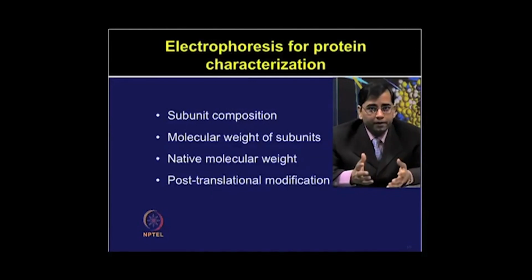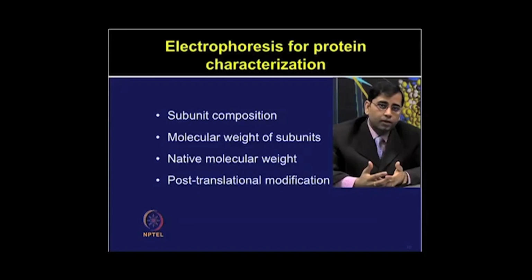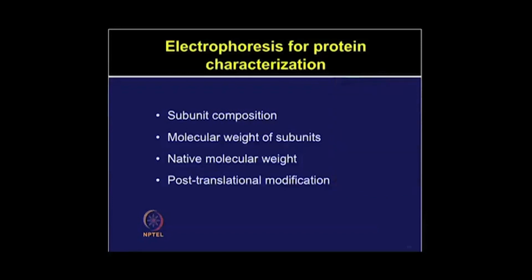If you want to compare the proteins based on their isoelectric point, as well as the separation of isoform or PTM form based on the molecular weight, again two-dimensional electrophoresis will be useful. So one needs to know the concept and the laboratory way of using these techniques, so that by applying a combination of the techniques, one can study different types of properties.